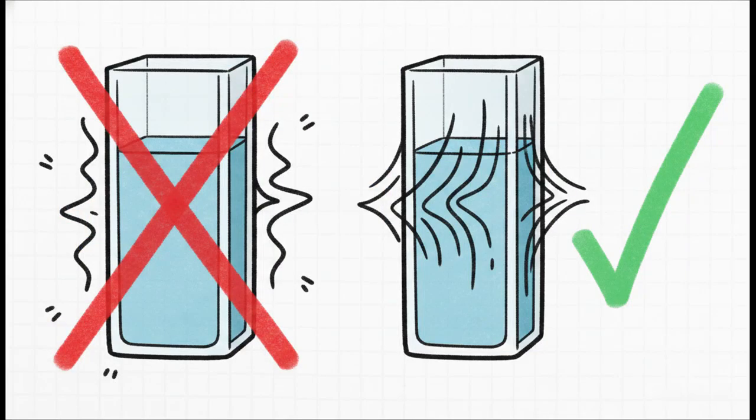Oh, and speaking of the sample holder, this is a super common trap for beginners. You cannot just use any old container. It is absolutely critical to use quartz or fused silica cuvettes when doing UV testing. Why? Because standard glass or plastic actually absorbs ultraviolet light. If you used a plastic test tube, it would absorb the UV rays before they even had a chance to touch your sample, completely trashing your data. Quartz, thankfully, remains perfectly transparent throughout both the UV and visible regions.